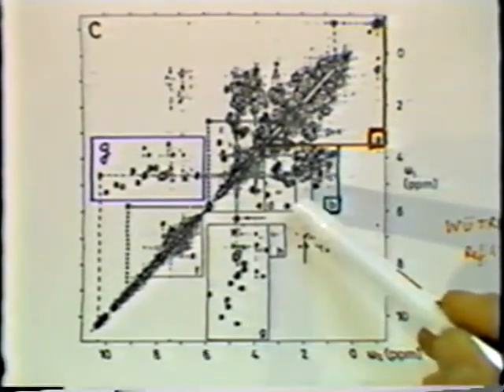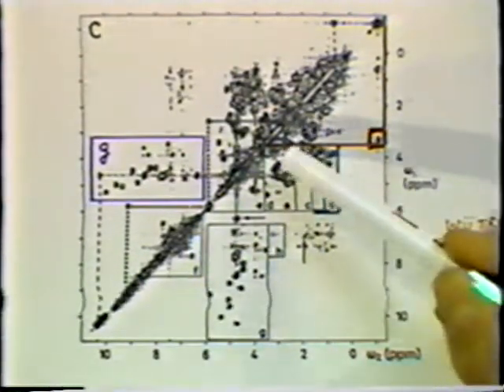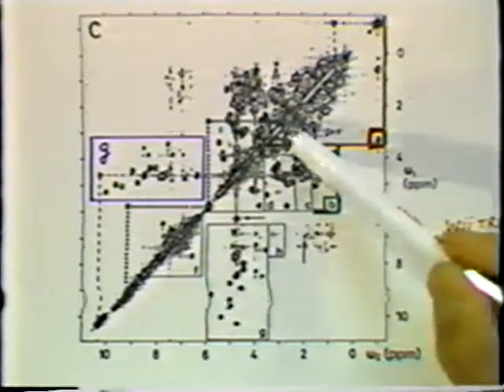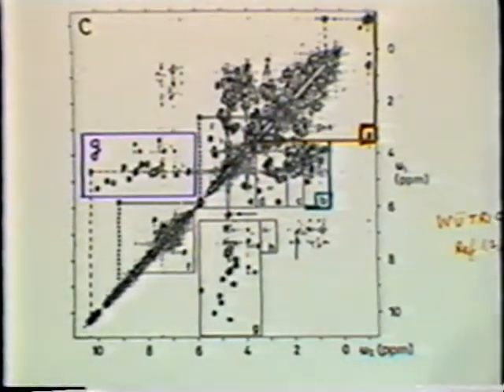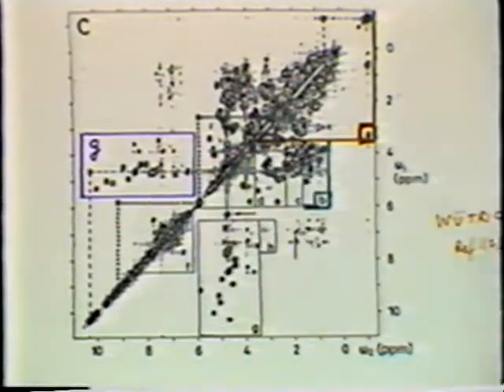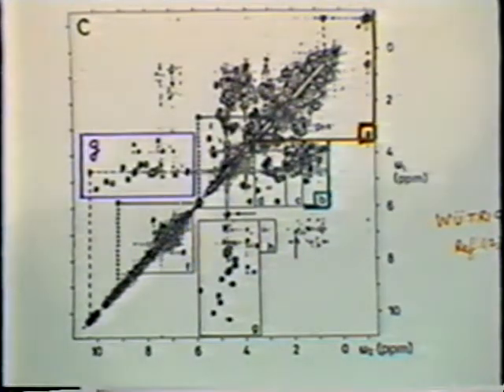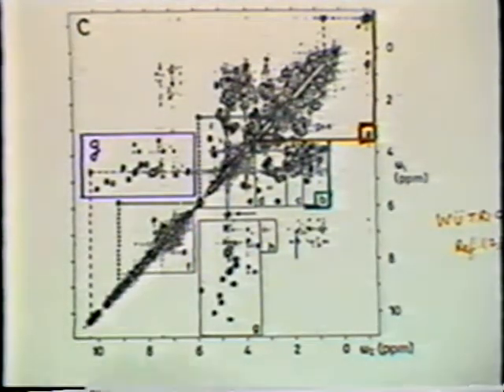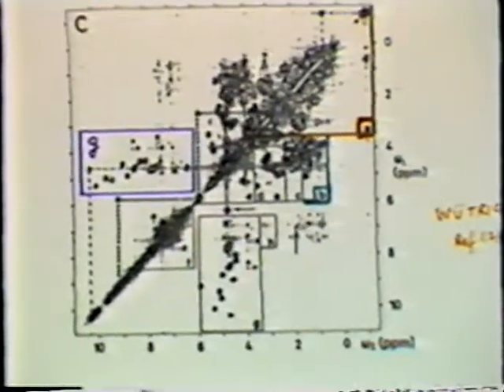The C part, and also the D part, I should combine all of it, give us cross peaks between the alpha and the beta resonances. The E part gives us some more cross peaks within alphas. For example, glycine has 2 alphas. Those cross peaks will lie in this region. And this F region is the one in which the aromatic protons will give cross peaks to each other.